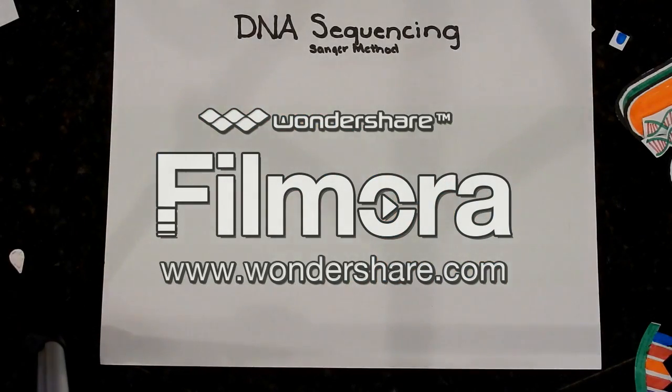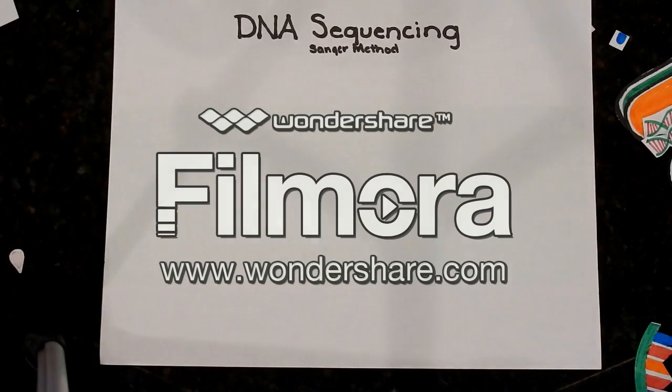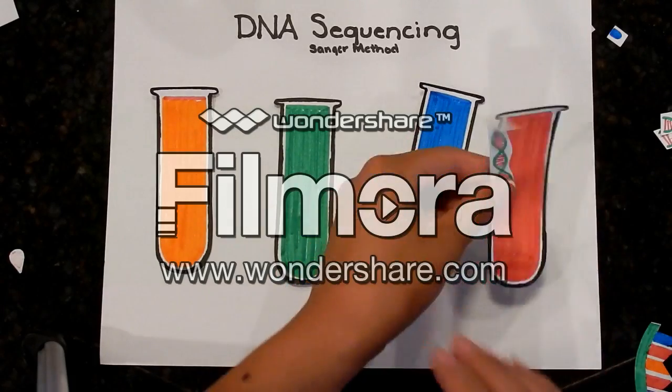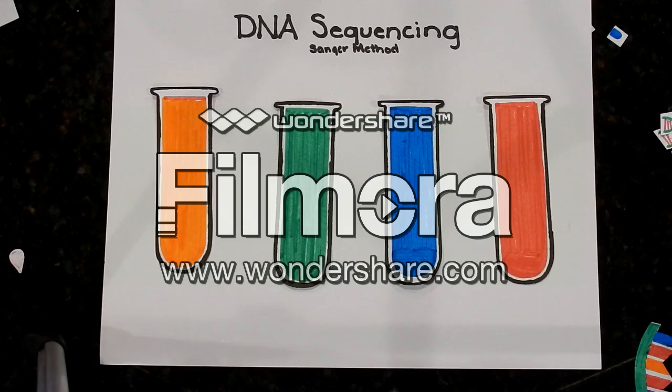Now that you have a better understanding between deoxynucleotides and dideoxynucleotides, we can continue with the DNA sequencing process. As I said before, the PCR cycling process and the DNA sequencing method are similar with the ingredients that are used for the 2 operations to work. However, we are going to separate the original copies of DNA into 4 different test tubes. So remember, all 4 test tubes have the same 5 ingredients, but add dideoxynucleotides.